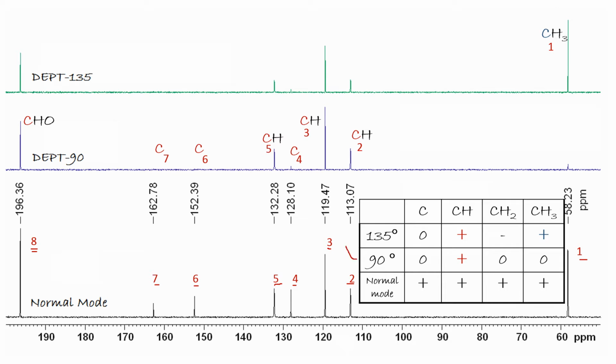We got the DEPT 90 degree. In DEPT 90, only the CH will be positive and the rest of the peaks will almost disappear.